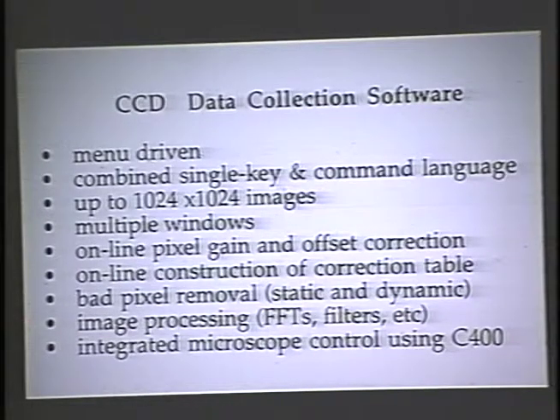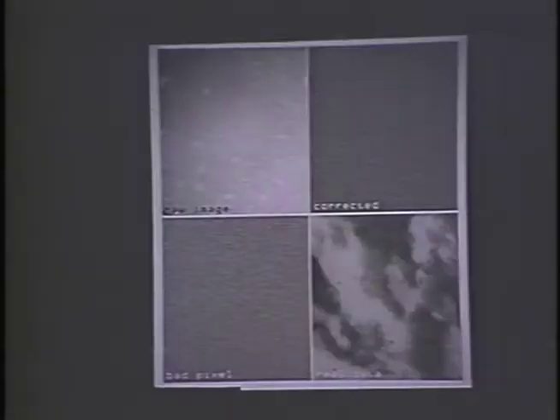There are other aspects of image processing and online automatic correction of problems with the slight variations in the gain and offset of each pixel that happen automatically. And as I say, there's also integrated control of the microscope through the C400.